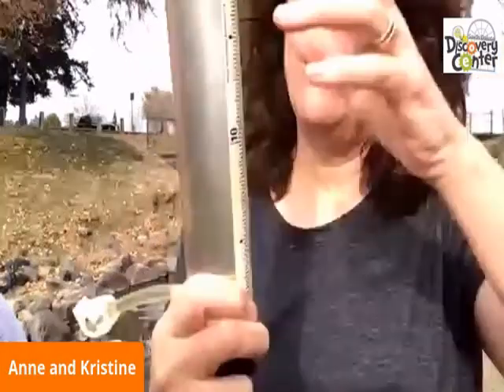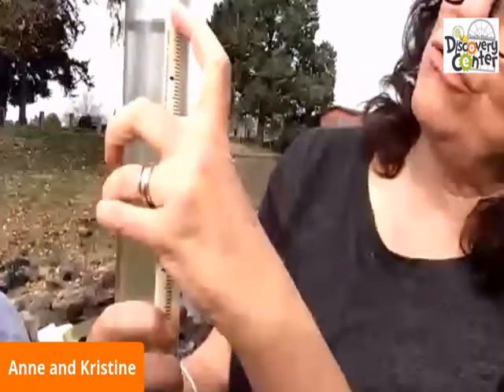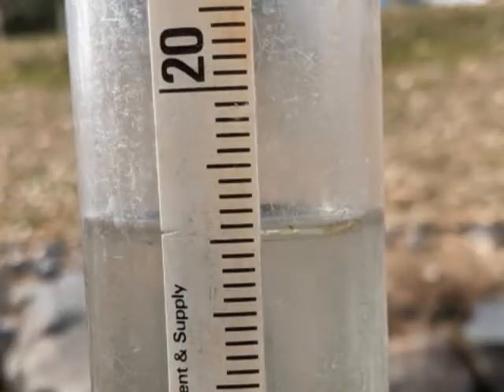All right, I can just barely see it. Okay. And we're at about, here's 20, so we count down 1, 2, so we're about 18 centimeters of water from the surface to the black and white pattern at the bottom. Well, that's pretty interesting. But what's really interesting is to compare this to other readings around the state.